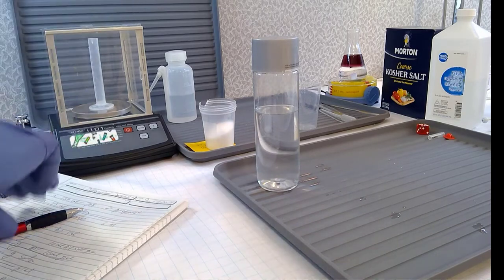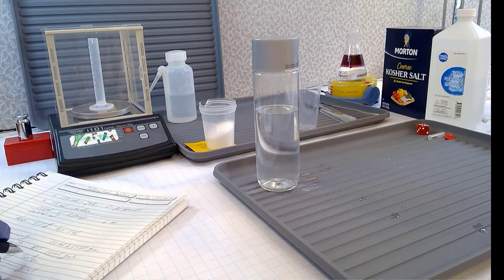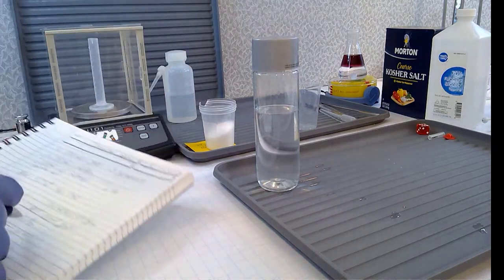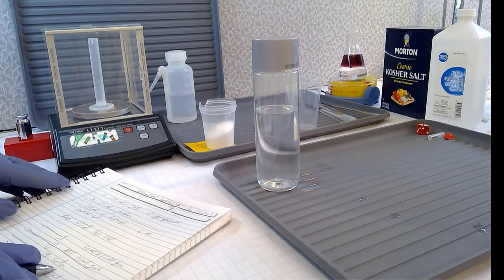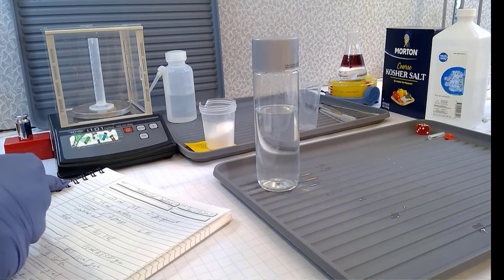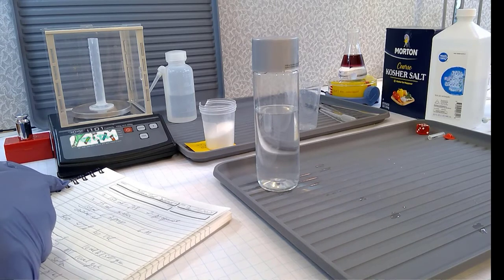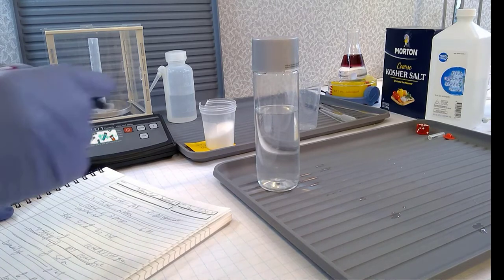Put the graduate on there and see what we get. Empty graduate. I have my lab sheet all set up with the table done ahead of time. That's kosher, and it helps me take care of things. Here it is, 7.535 grams. Okay, it's staying stable.